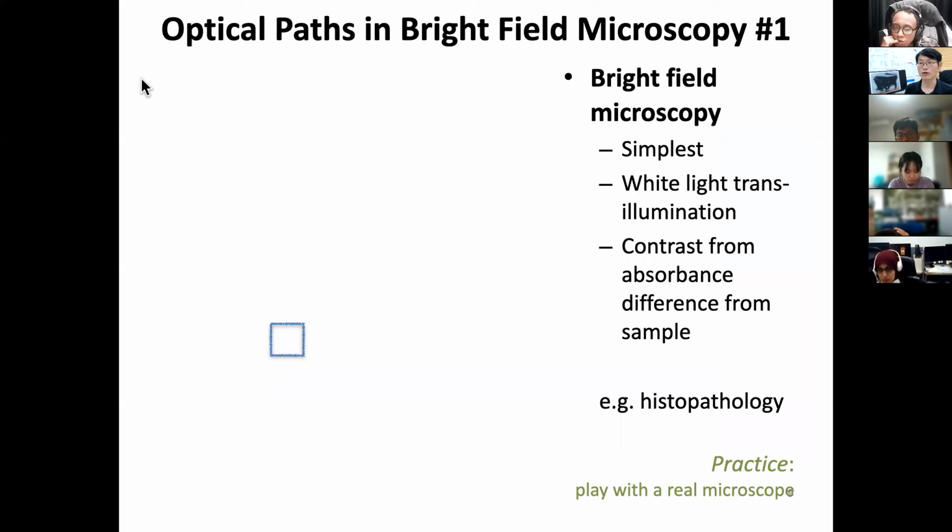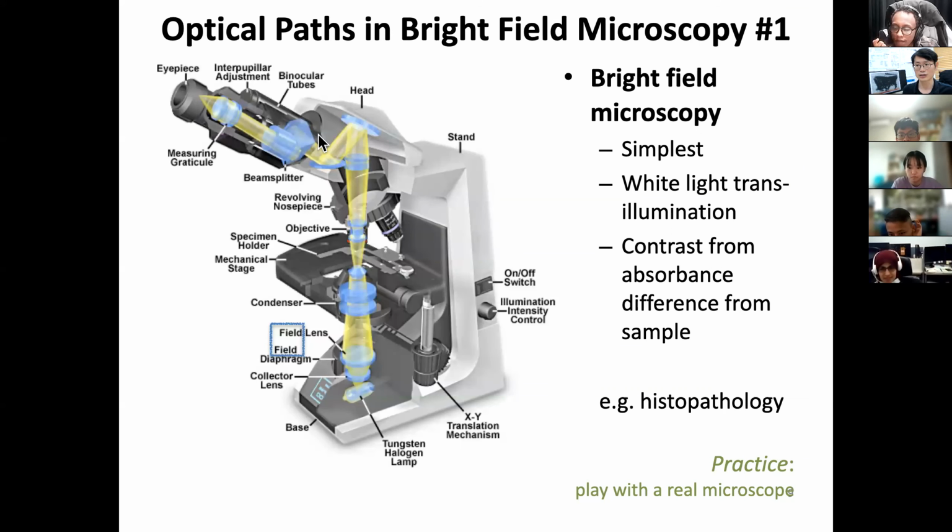So now I want to go back to our bright field microscope, which is the simplest and most widely used. Typical microscopes are just looking at absorbance, because you are looking at the color of the light. So this is a microscope, and Jungmyo talked about the condenser, but I want to add one more thing here. Typically there's a halogen lamp on the bottom.